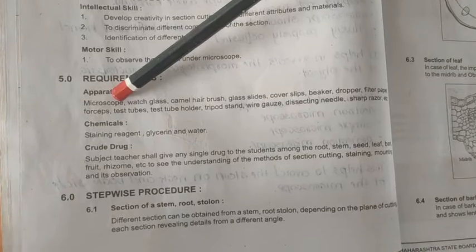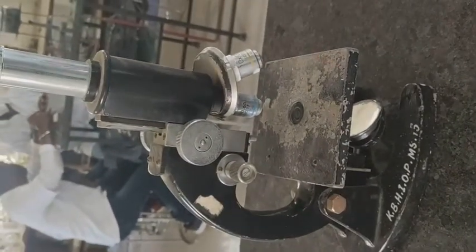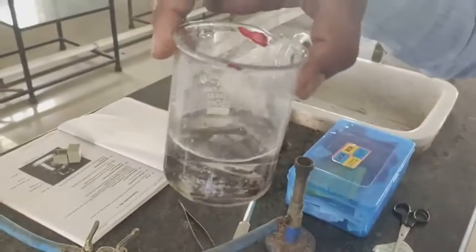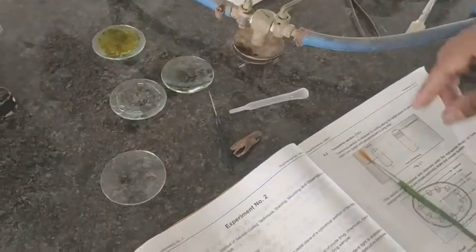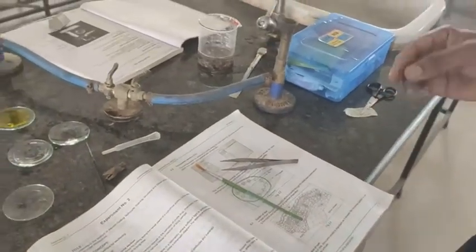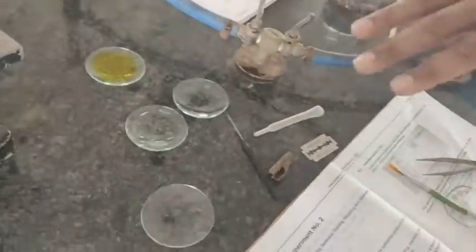Next, the things you require: first is your microscope, then your watch glass, next your camel hair brush, next your glass slide, then cover slip, then beaker, then dropper, then filter paper, then forceps, then test tube stand, wire gauze, dissecting needle, then your sharp razor, etc. These are the important things required for section cutting.